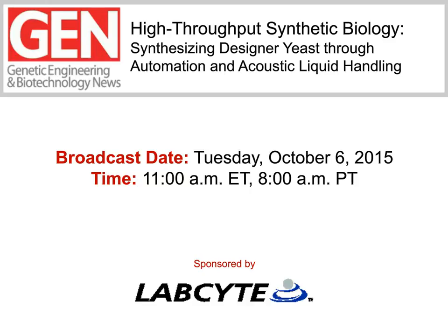It's entitled High Throughput Synthetic Biology, Synthesizing Designer Yeast Through Automation and Acoustic Liquid Handling. Synthetic biology is a relatively new field, and it's already drawing huge amounts of attention in the life science community. This technique focuses on producing engineered organisms to perform new and useful functions. It aims to develop technologies, methods, and biological components that will ultimately make the engineering of biology safer and more reliable. Today's Gen webinar has been designed to illustrate how a specific approach using acoustic liquid handling complements synthetic biology research and provides experimental data from streamlined workflows that show increases to overall productivity.